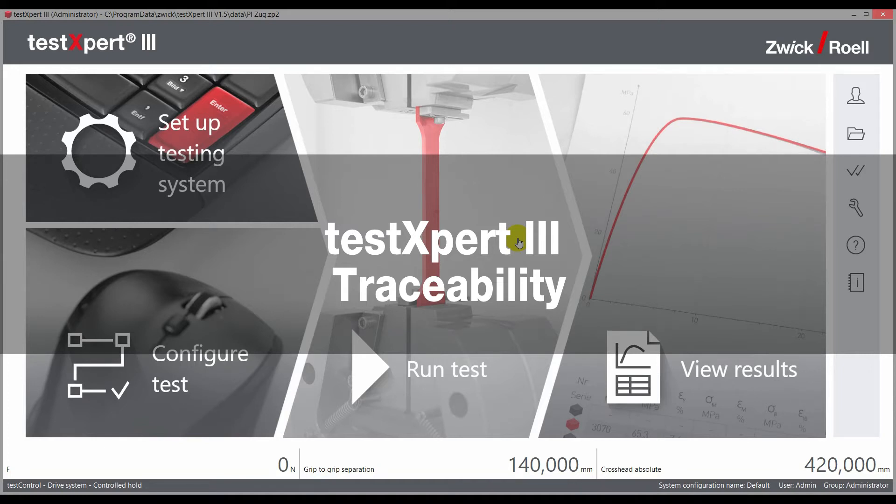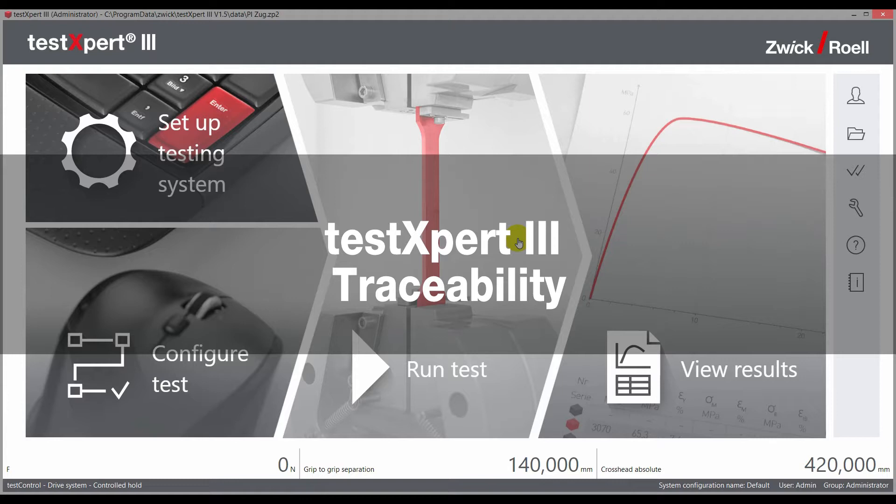The following video shows the possibilities provided by the Traceability option in TestExpert. Zwick Roell developed this option with renowned pharmaceutical and medical technology companies, sold it well over 1,000 times, and qualified it according to the strict requirements imposed by the FDA and other organizations.